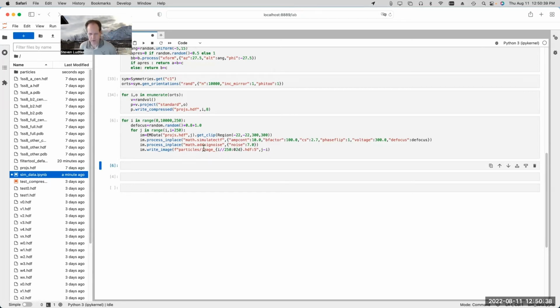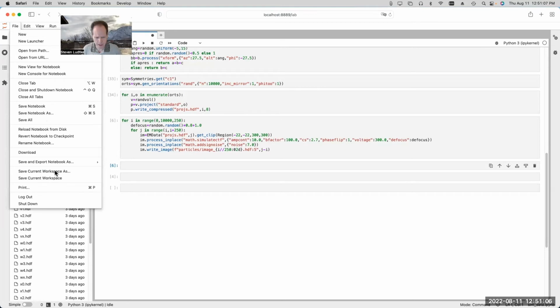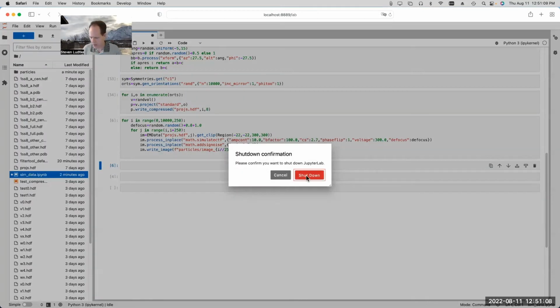Now, I guess the question is, when we do the reconstruction, since the particles are highly variable, whether we're going to have to do anything to account for that. I'll do a C1 reconstruction, obviously, because I could start with D8, or D7, the symmetry of a normal GroEL. But since in the end we need to end up with C1, it may just start with C1 in this case. All right, so I'm going to shut this down.